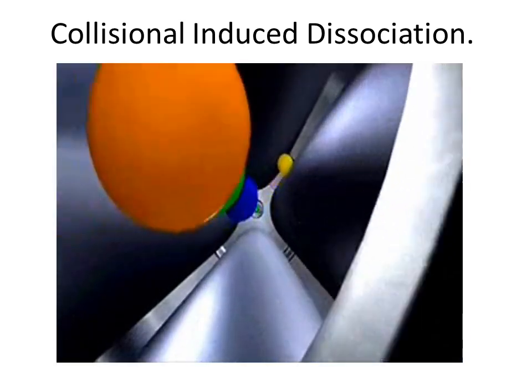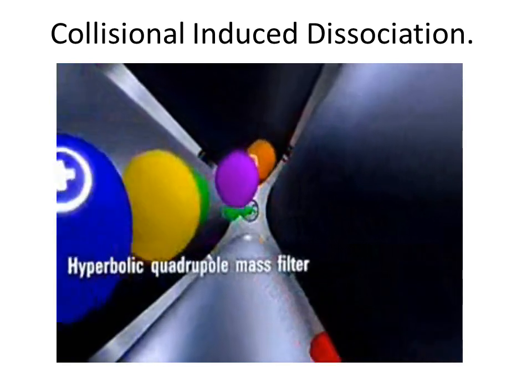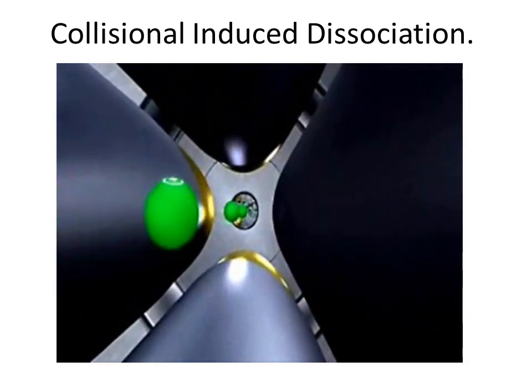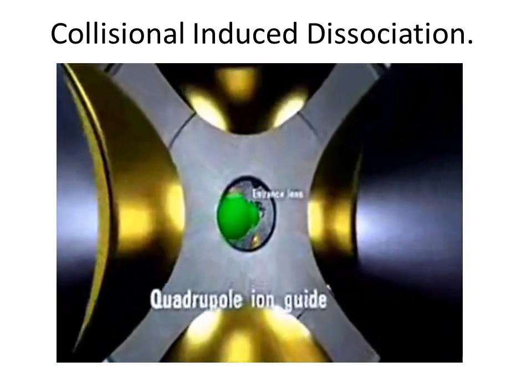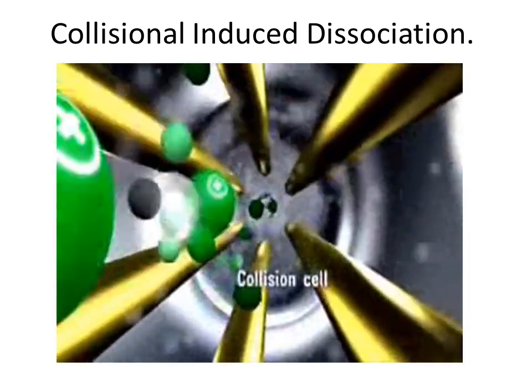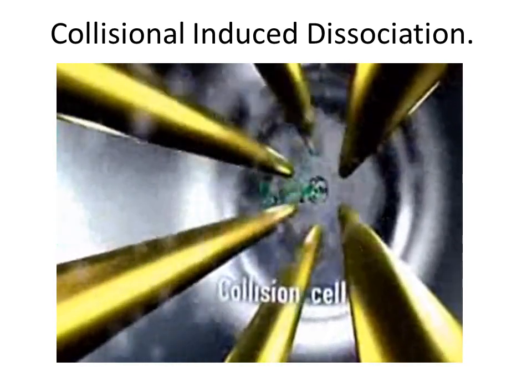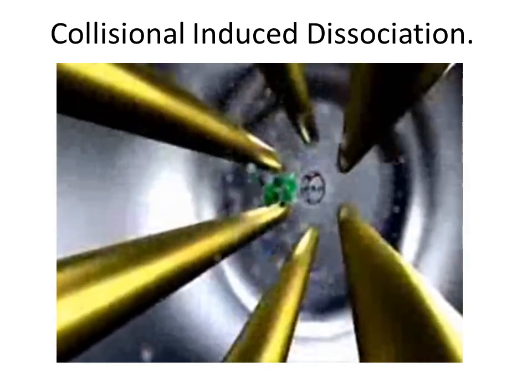To see how the mass spectrometer does this in practice, we return to part of the quad-TOF animation. As mentioned in the last presentation, the quadrupole 1 can be used to select only one ion to the exclusion of all other ions being sprayed in. These ions then get transmitted to a collision cell filled with nitrogen gas, where fragments are produced by collision with those nitrogen gas molecules.